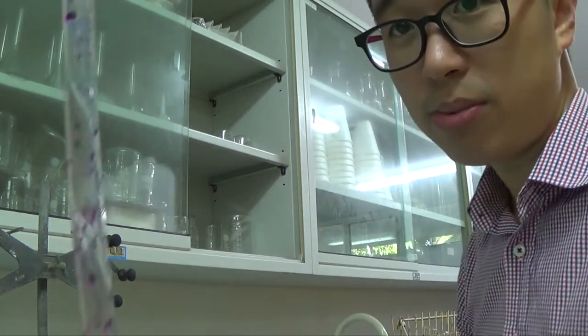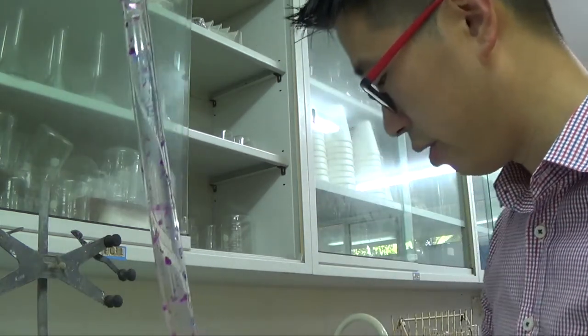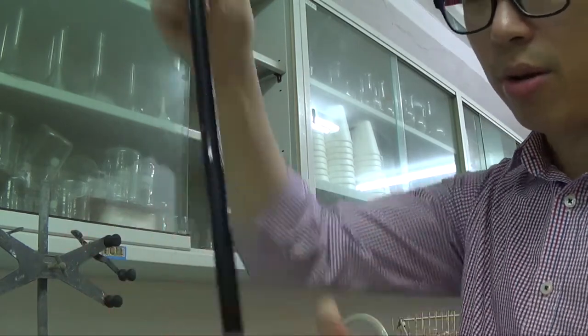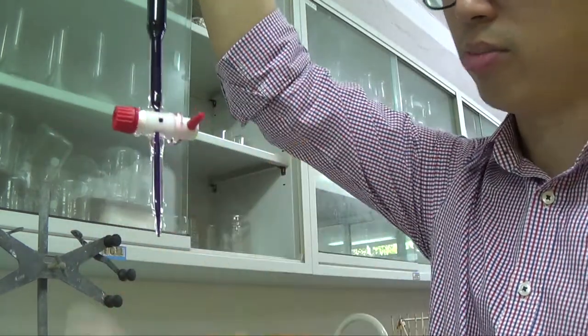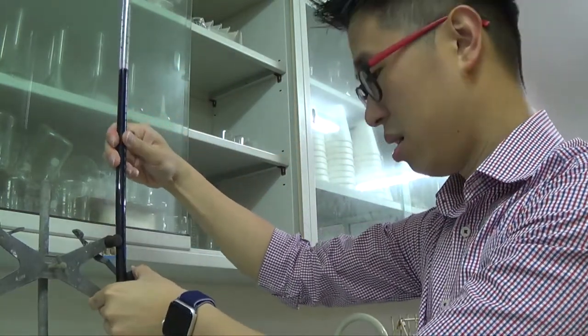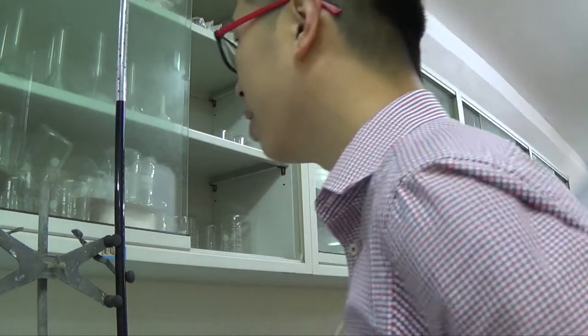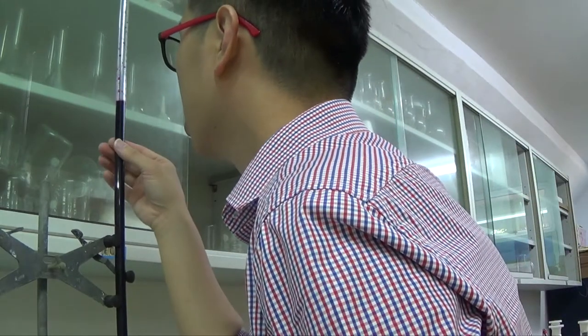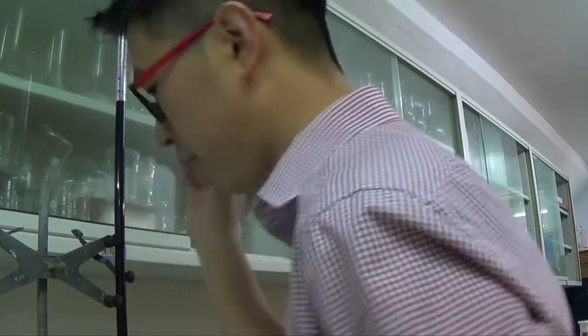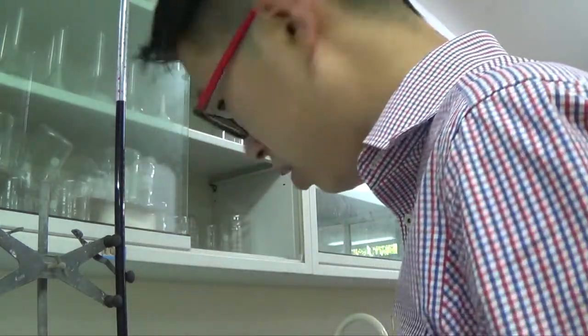So I'm not filling it up to zero because it's hard to read above the meniscus for such a dark colored solution. Remember that the bottom is already filled from just now, from the first pass of the volume. Let it settle for a little bit and then I'll read it. So this is reading above the meniscus. This is 11.50. This is 11.